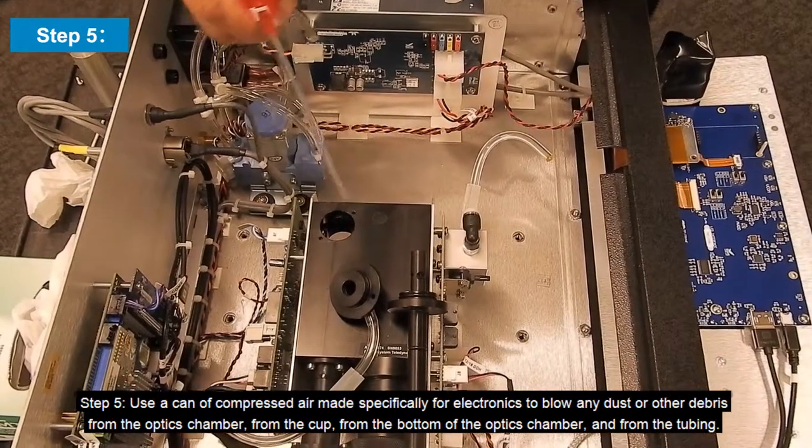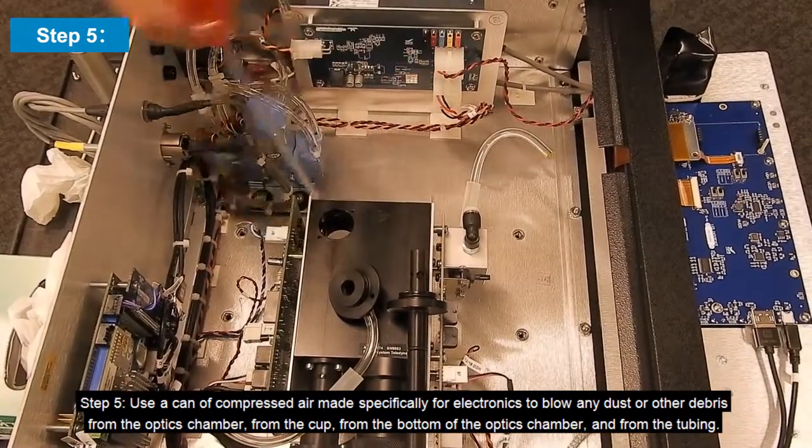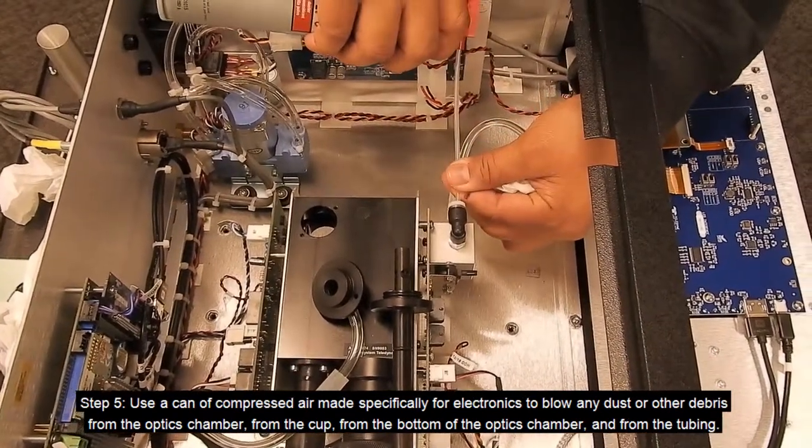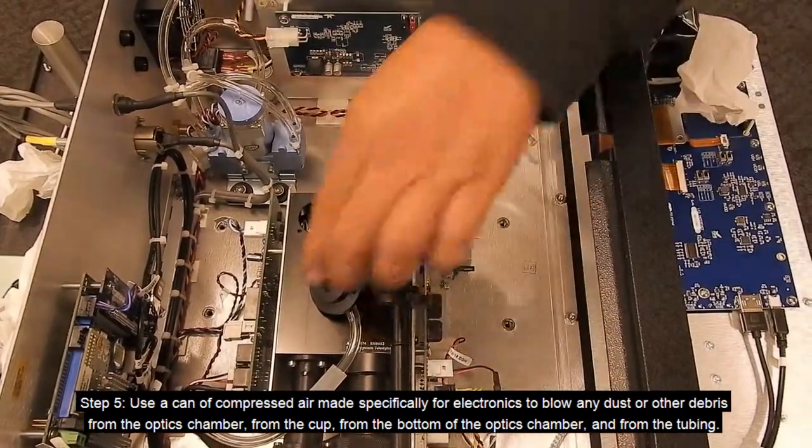Step 5: Use a can of compressed air, made specifically for electronics, to blow any dust or debris from the optics chamber, cup, bottom of the optics chamber, and tubing.